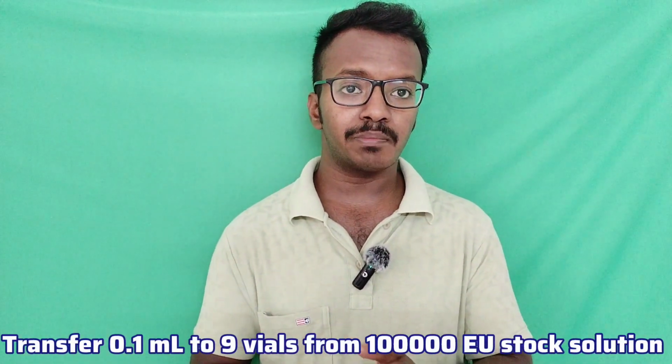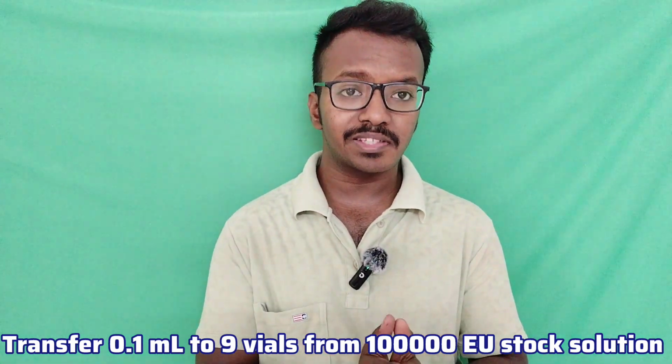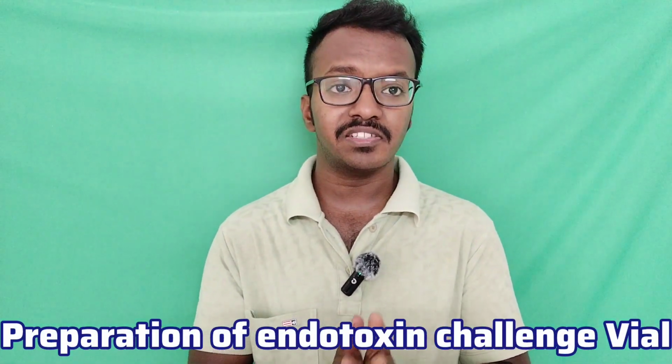For example, here we are taking 9 vials. Based on the validation approach, the number of vials varies. So, transfer 0.1 ml to all these 9 vials. After spiking 0.1 ml of known endotoxin concentration, these 9 vials are challenged with 10,000 EU. Then allow these vials to air dry to ensure proper endotoxin distribution. This process is called preparation of endotoxin challenge vials. So now we have 9 vials with 0.1 ml of known concentration of endotoxin, 10,000 EU.